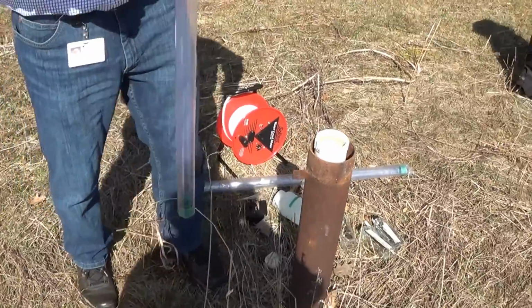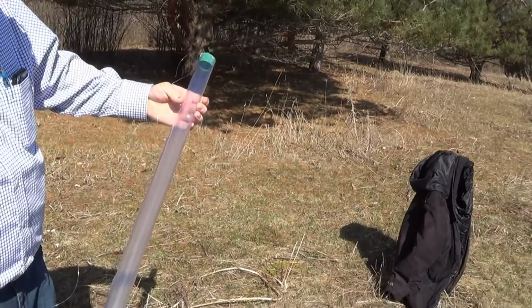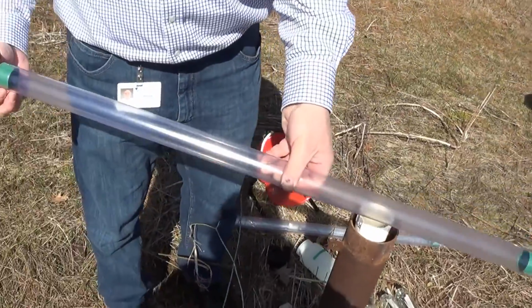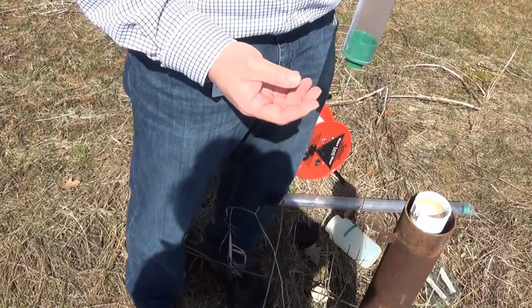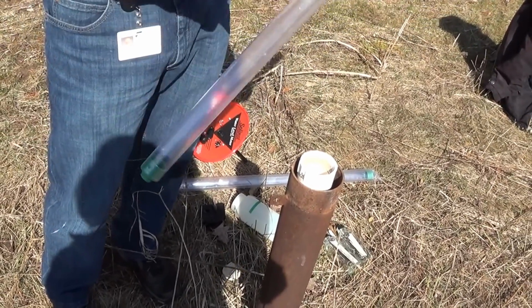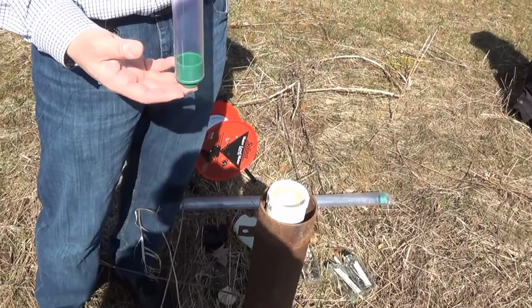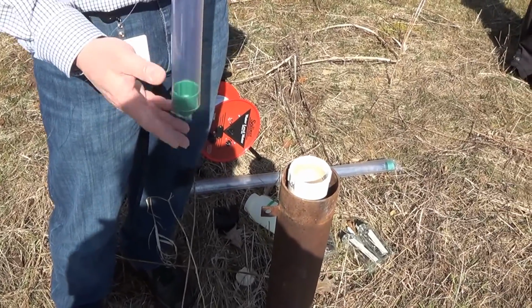So I have the baler ready, and I'll show you the baler. Again, it's a 1 liter volume, and on the bottom here you'll see just a little check, or a little ball. When you lower the baler into the water, the ball allows water to come into your baler. Then as you pull it up, that little ball seats on the bottom. It's called a foot valve.